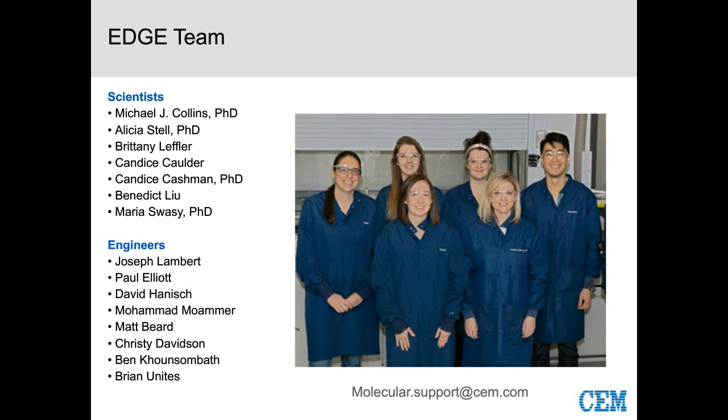So after extraction, do you inject from that liquid directly, or is there more sample prep or dilution? And where do you add the internal standards in this process? Yeah, okay, that's a really good question. So yes, you go directly, right? When you collect your extract on the edge, it is filtered, it is ready for analysis. Like I said on that post step slide, you may have lost a little bit of solvent during the process, so you're going to want to dilute to a known volume. But typically, you're just using the graduations on the centrifuge tube there, and maybe adding just a few drops.